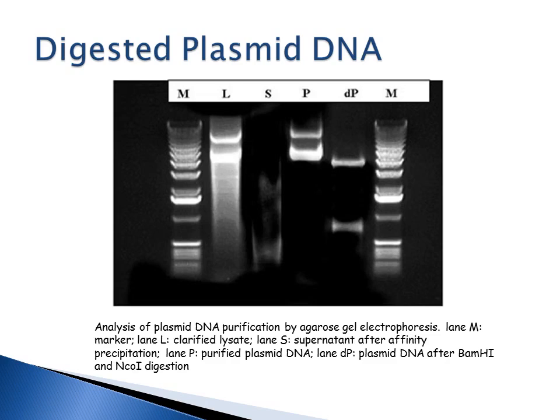In your DP, that's plasmid DNA after it's been digested with two different enzymes. And what you're going to end up with are the pieces of the plasmid DNA that are left after it's been cut with these enzymes. So the enzyme digestion and plasmids and all that is going to make a lot more sense when we talk about restriction enzymes and recombinant DNA technology.